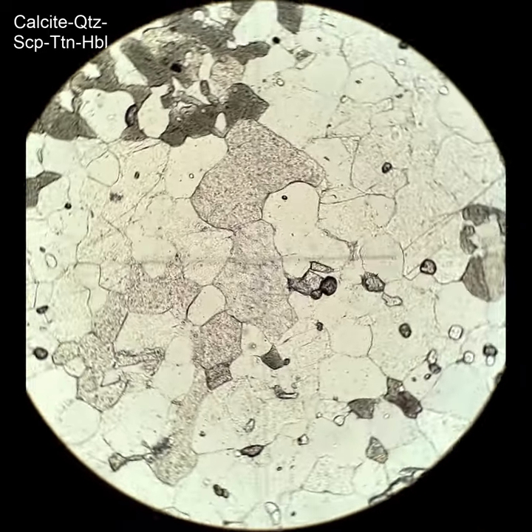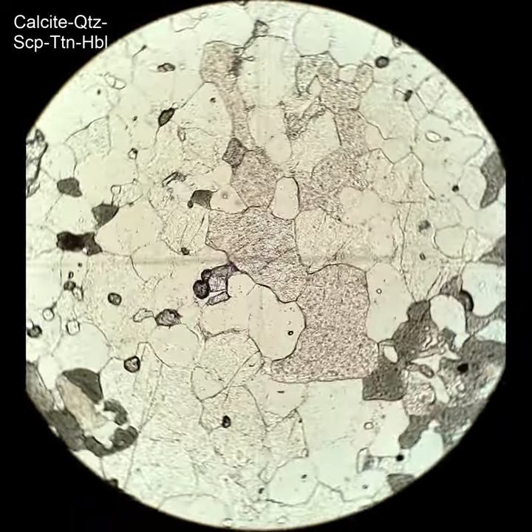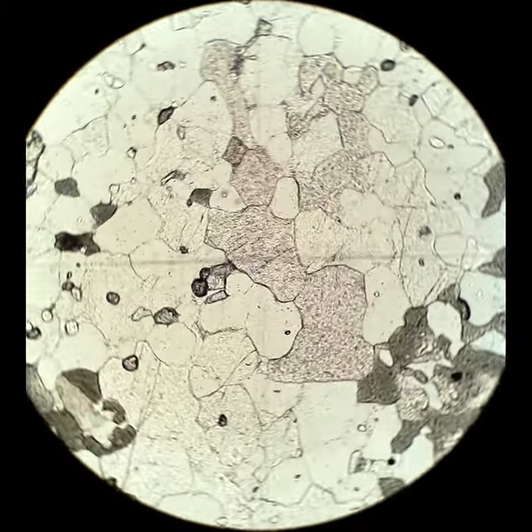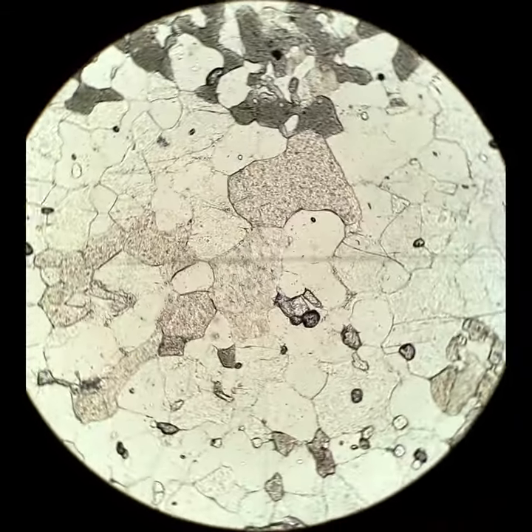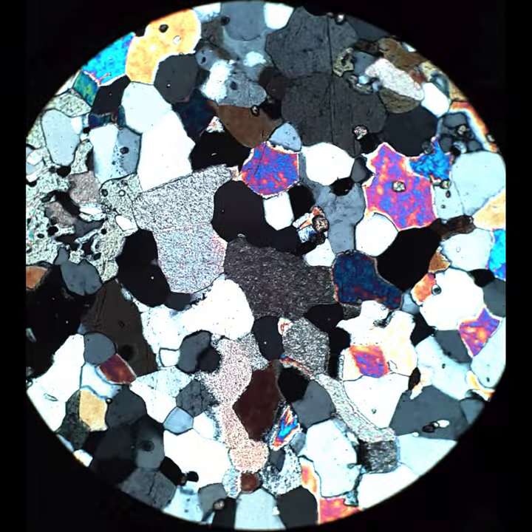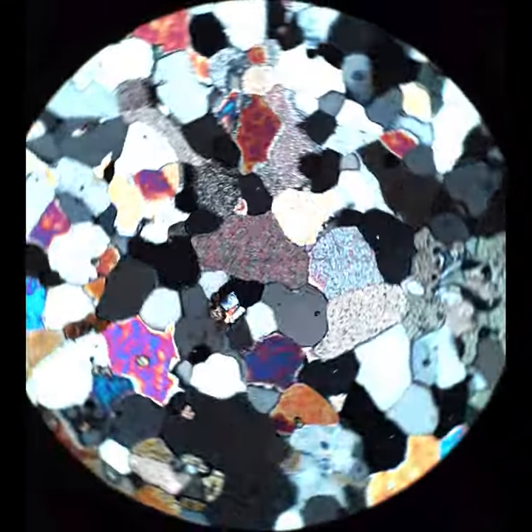This is fairly typical calcite. It's the kind of brownish, fuzzy-looking grains towards the center. It has variable relief — I'll explain what that is a little bit later. But it has really characteristic interference colors. They're super, super high, so you get these pastels.